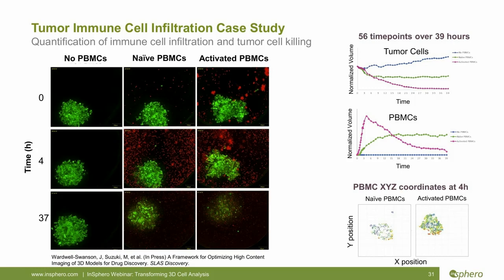In contrast, with CD3, CD28 activated PBMCs, the pink trace, we observe a prolonged and highly efficacious tumor killing profile that's consistent with T cell activation and which results in complete tissue destruction by 20 hours.